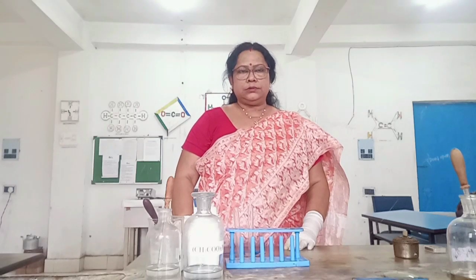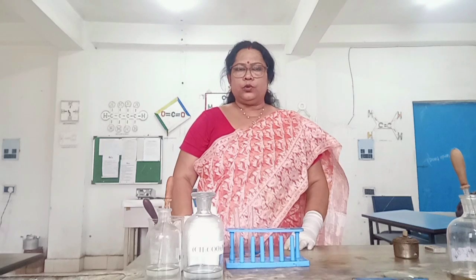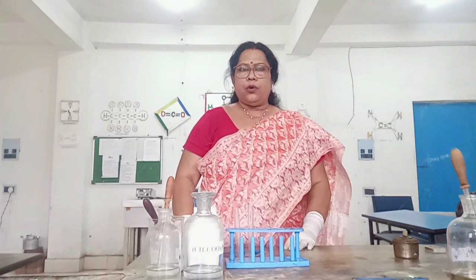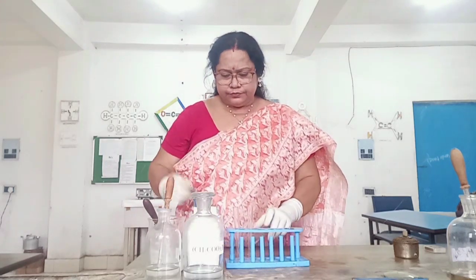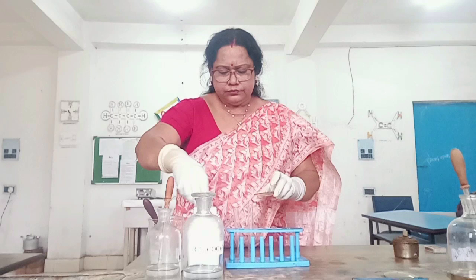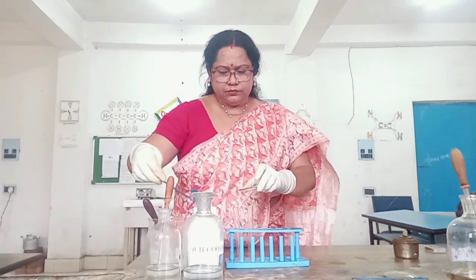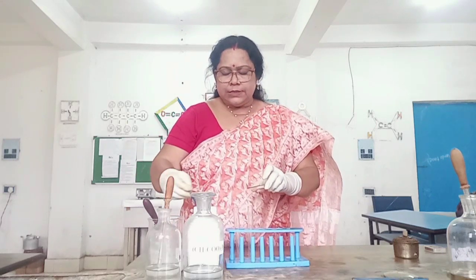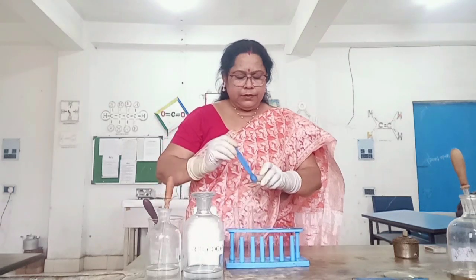Hello students, today we will learn the confirmatory test of chloride ions. First, take some original salt in a watch glass. To this, add potassium dichromate crystals and mix the contents.